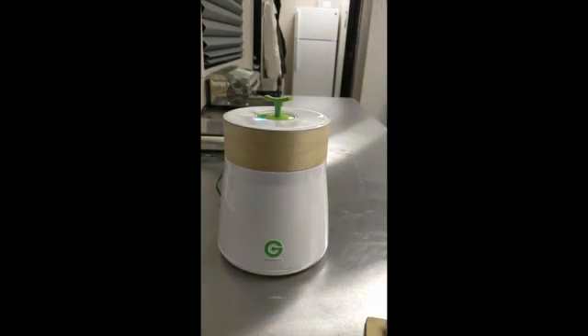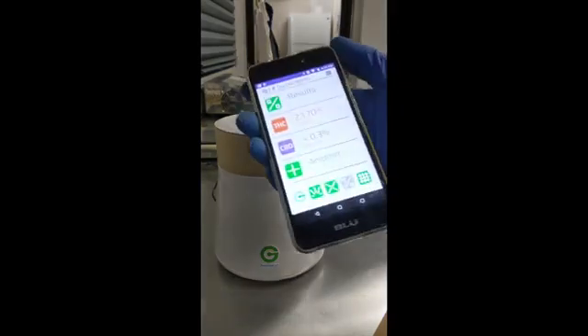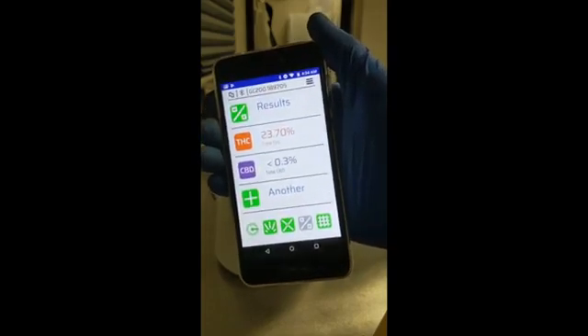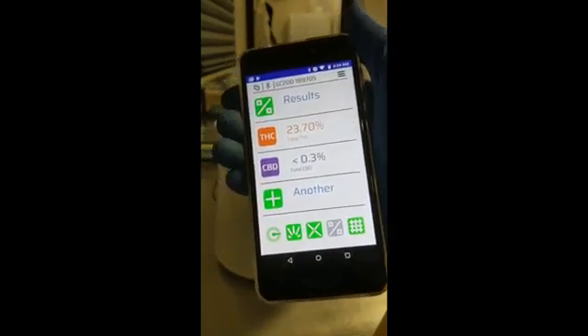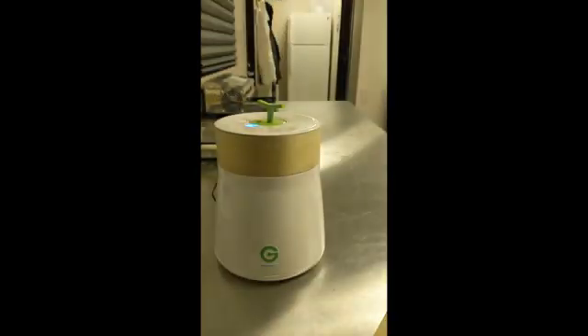This is the second time I've done this test. It's reporting 23.7% total THC and less than 0.3% total CBD. These are very close to what the California certified laboratory results came back at, which were 22.9% THC and 0.528% CBD. I've done many repeatability tests with this device and found it to be extremely repeatable — this same flower I tested just previously came back with almost identical results.